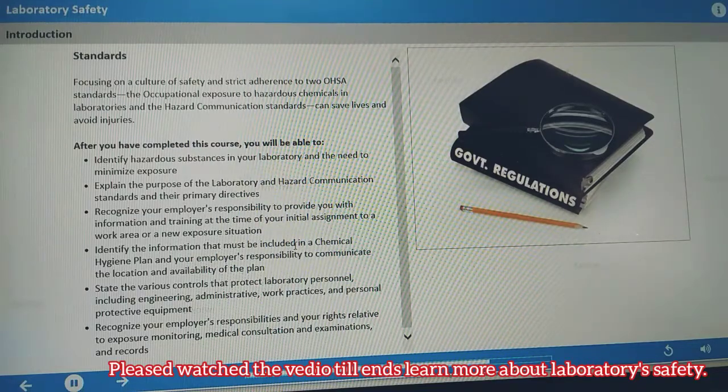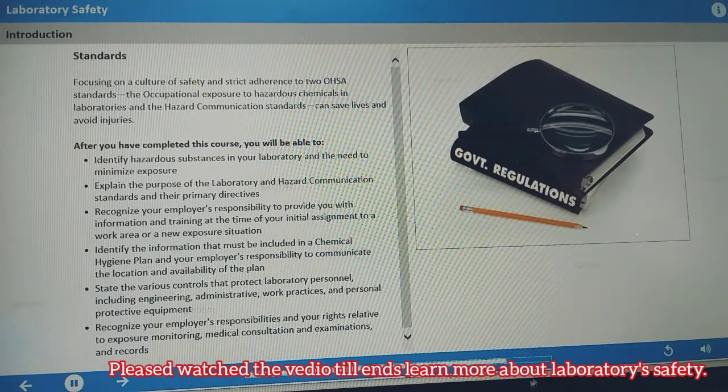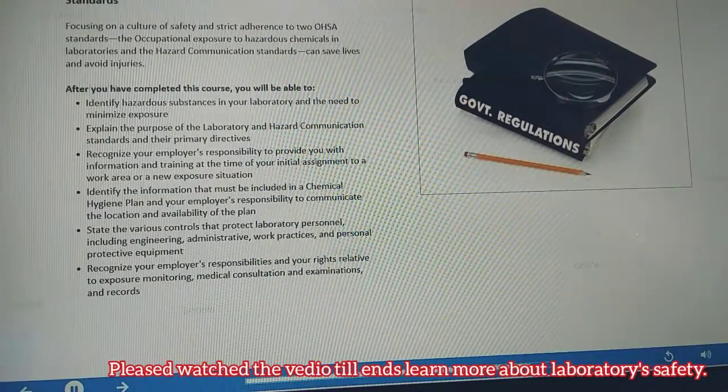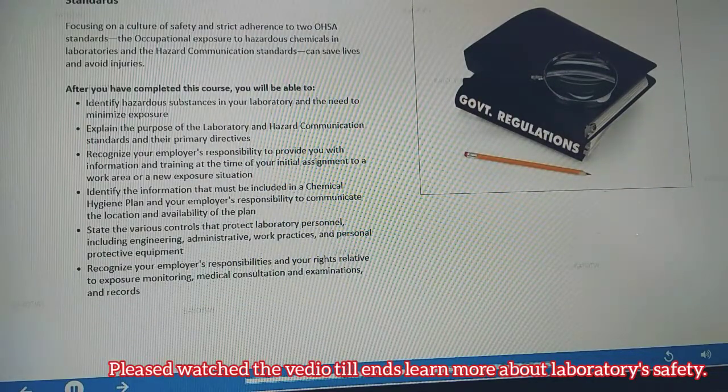The course also raises awareness of the standard requirements for communication, exposure monitoring, medical consultation, and record keeping.